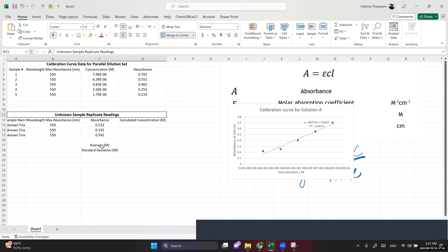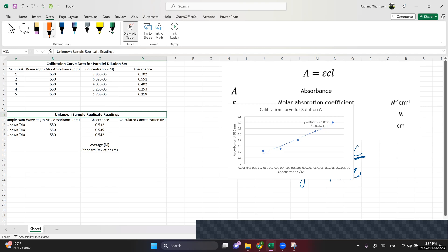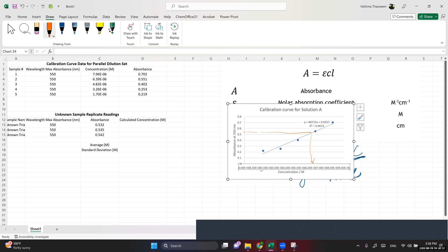Now, for an unknown sample where we don't know the concentration, we use this calibration curve. In practice, I'm measuring the same unknown sample three times and getting slightly different absorbance values. In science we always take multiple measurements to get an average and standard deviation. My average absorbance is 0.532, which falls between 0.5 and 0.6 on the graph — so concentration should be somewhere between 6 and 7 times 10 to the power of minus 6.